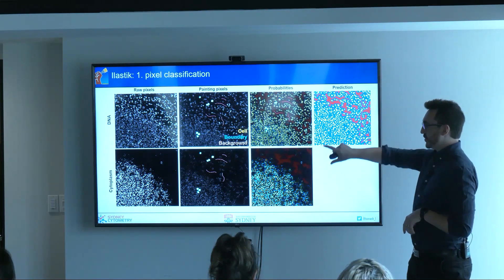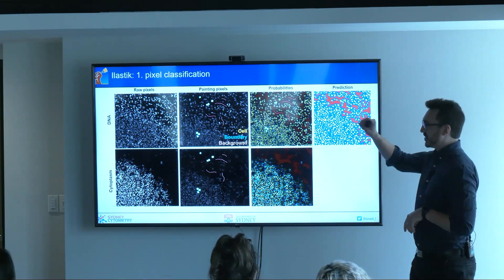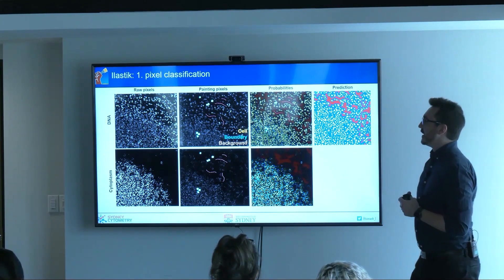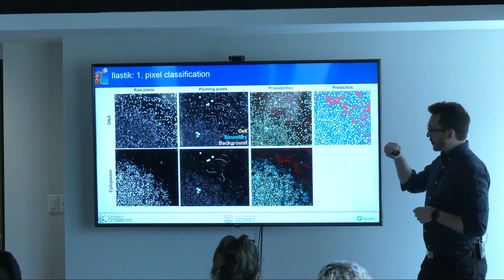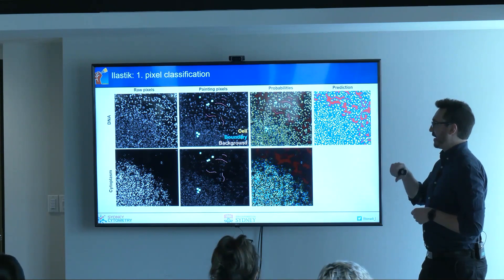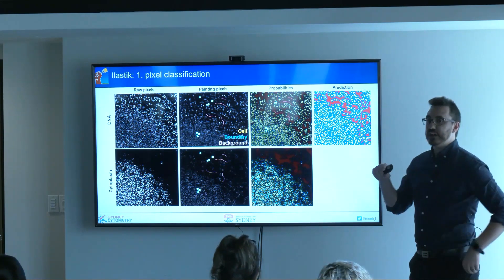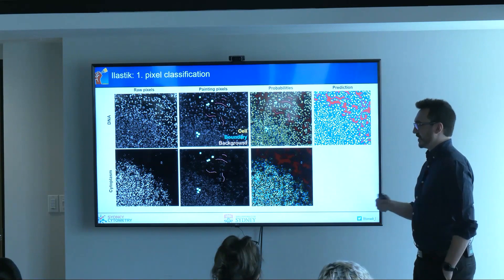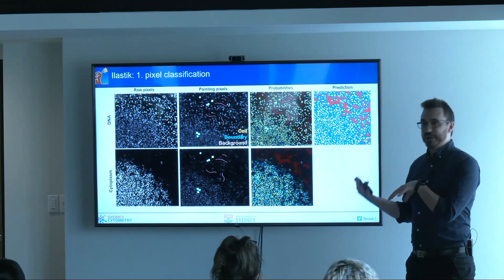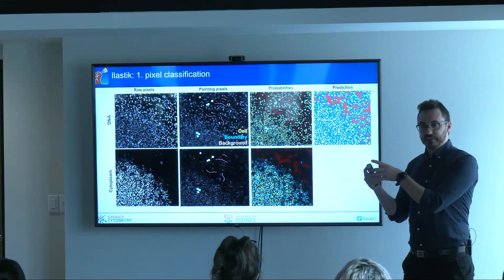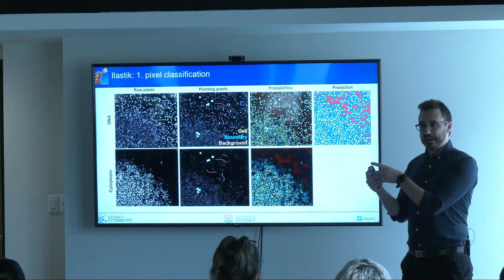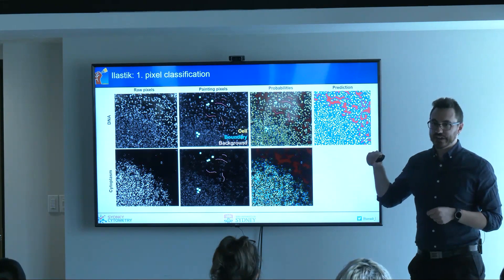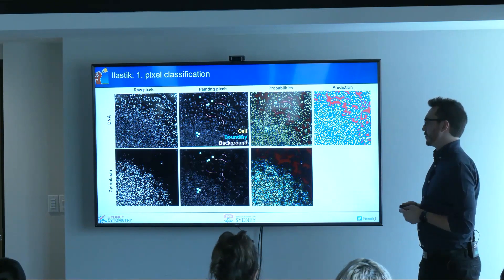We take the raw data and paint on layers in a program called Ilastik. We create a cell coloring in yellow, a boundary in blue, and background in red. We don't actually need a cell label — we need something where the cell is a different color to the background — but the principal thing is we're identifying the border between each cell as accurately as possible.